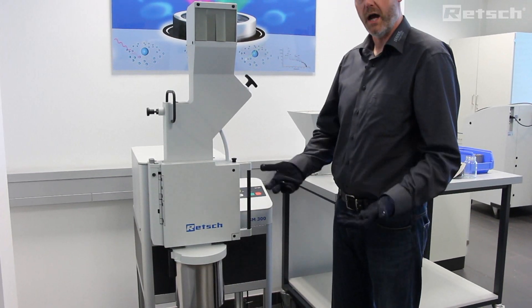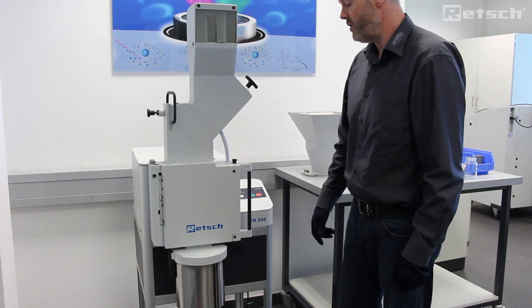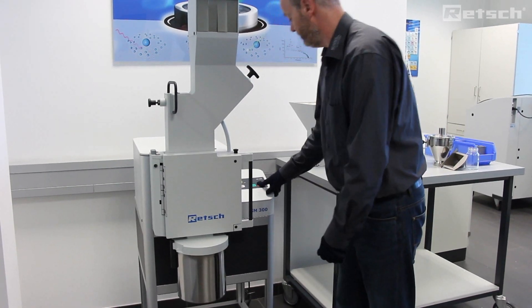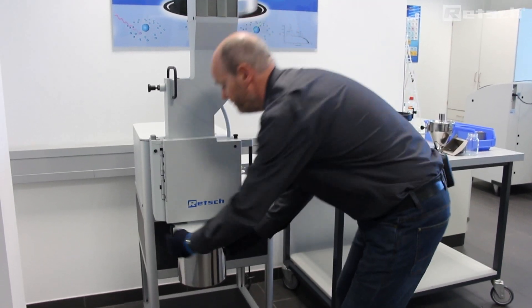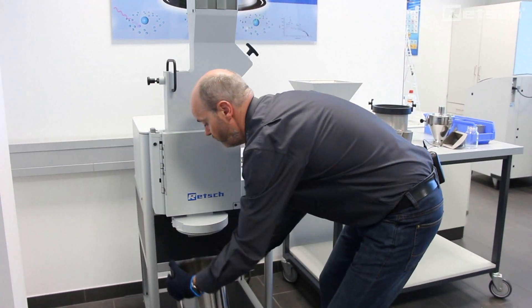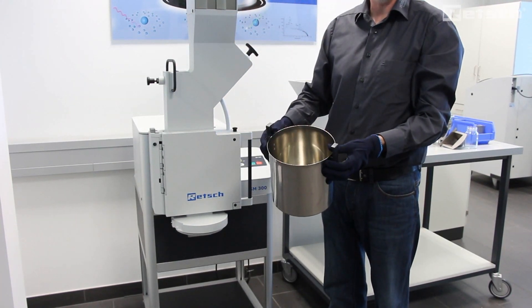After some time, all of the sample material will be expelled through the bottom sieve. We simply stop the instrument, remove the collecting receptacle and recover the ground material.